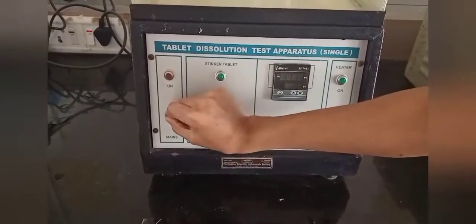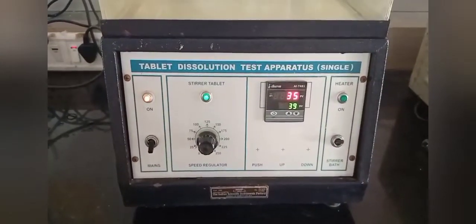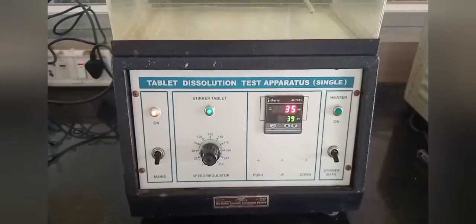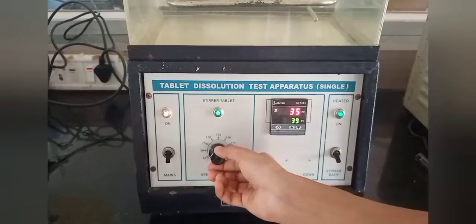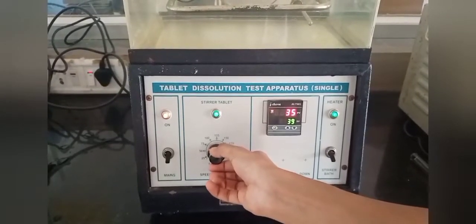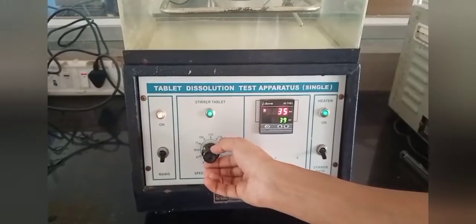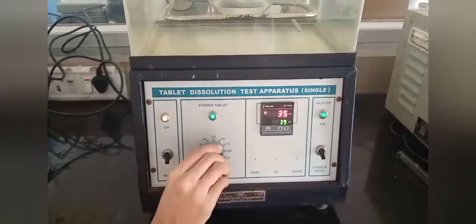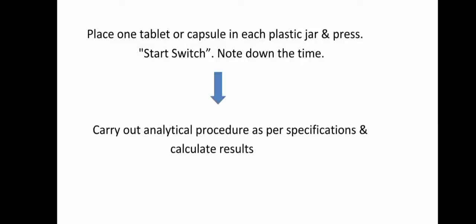Here we can switch on the machine and regulate the RPM. Next, place one tablet or capsule in each plastic jar and press the switch, and note down the time. Carry out the analytical procedure as per specifications and calculate results. Here we can see that clearly our tablet is dissolving.